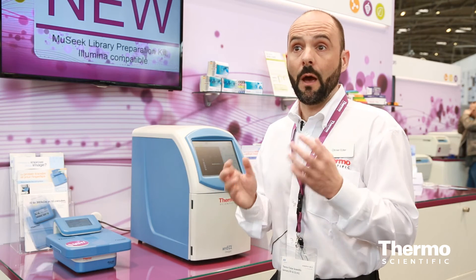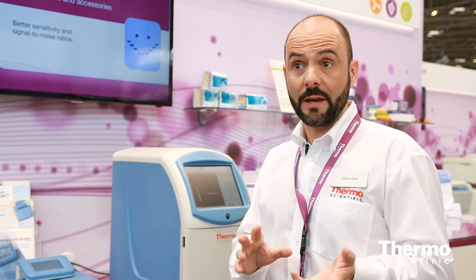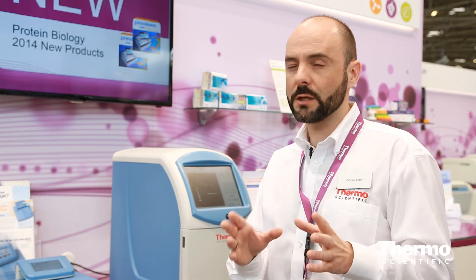The system is preloaded with three types of programs, selected according to the number of gels you want to transfer and the molecular weight of your protein of interest. So whatever your condition, you can find the right program. If you need specific conditions in terms of time or power, you can edit, modify, and save those programs for future use. Learn more at thermoscientific.com/g2blotter.